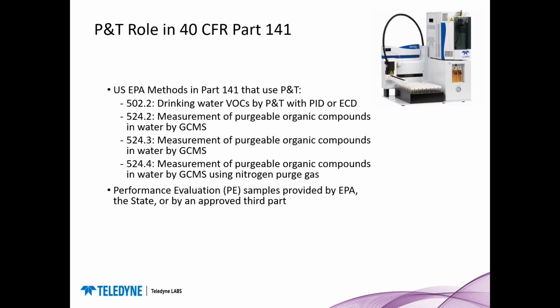In order to stay in compliance and receive certification, laboratories need to analyze performance evaluation or PE samples provided by the EPA, the state, or an approved third party at least once a year by each method for which a laboratory desires certification. So that is another big part of Part 141.